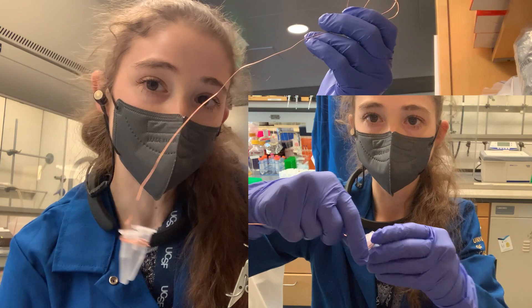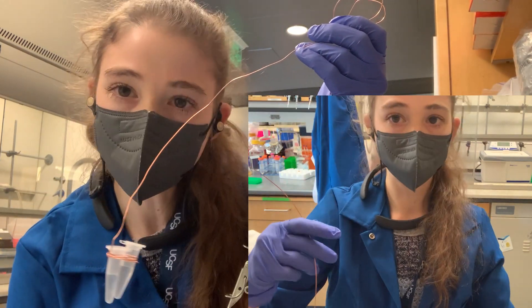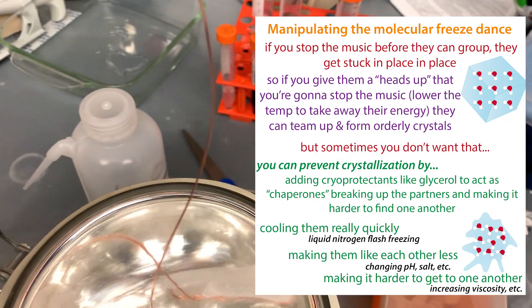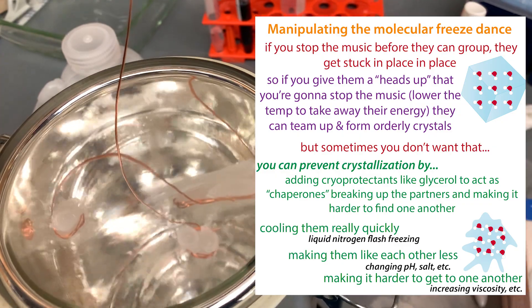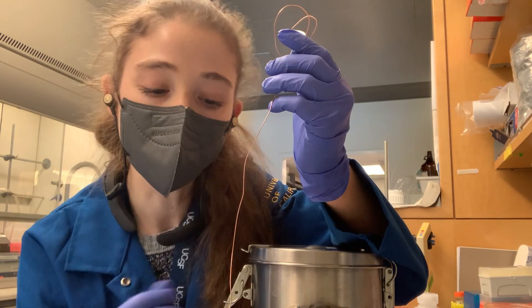Flash freezing in liquid nitrogen is a really great way to freeze samples, especially protein samples where you don't want ice crystals to form. Flash freezing with liquid nitrogen allows you to freeze really quickly so that all the water molecules don't have a chance to hook up with one another and form their lattice network, which gives you a crystal. And when water freezes, it expands, and this can cause problems.